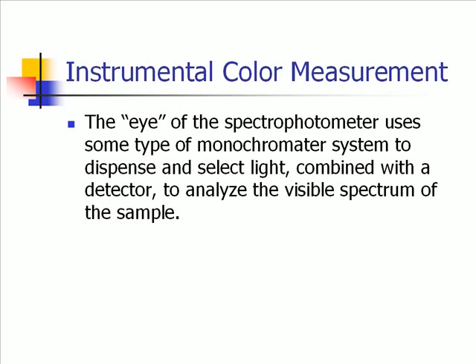One example of that is there's a company that sends out samples to lots of people that have spectrophotometers, and the whole idea is to see if they'll get the same numbers as everybody else. The samples are all the same that they send out, or at least as close as they can get. And then they take their readings at each plant, then they send the data back to the central company, and then they put all that data together and show what the range is that people get from it.